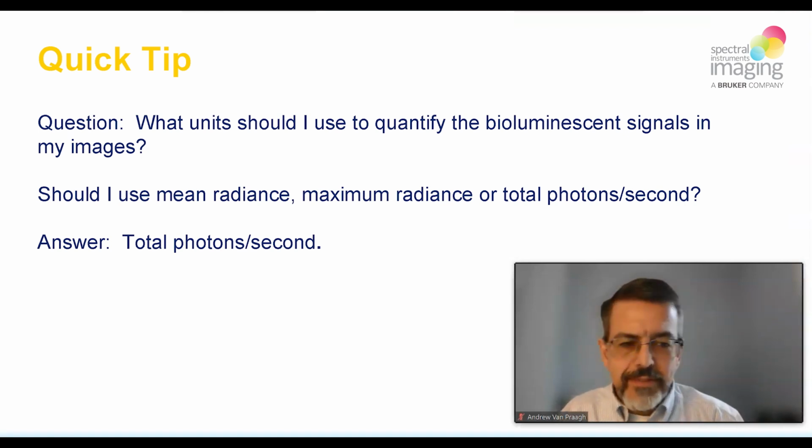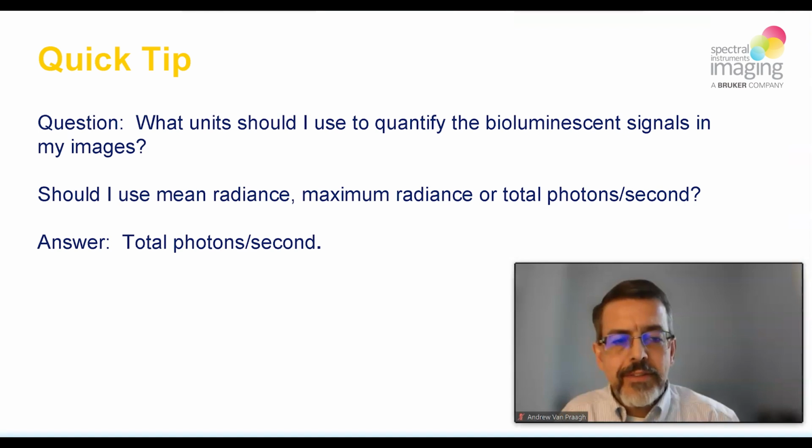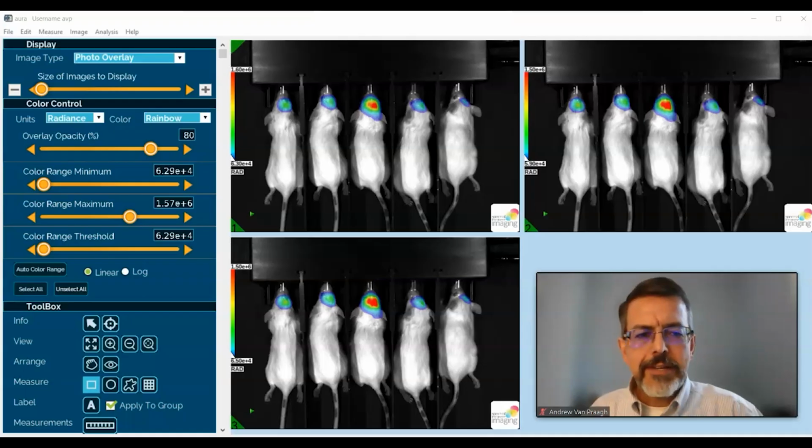The rest of this quick tip session is going to be devoted towards demonstrating empirically why, in fact, this is the answer, that you want to use total photons per second whenever you are quantifying your bioluminescent signals in your optical images.